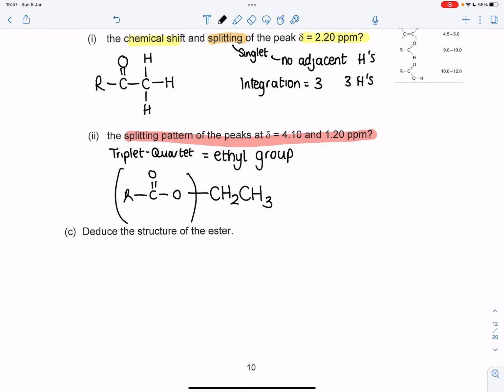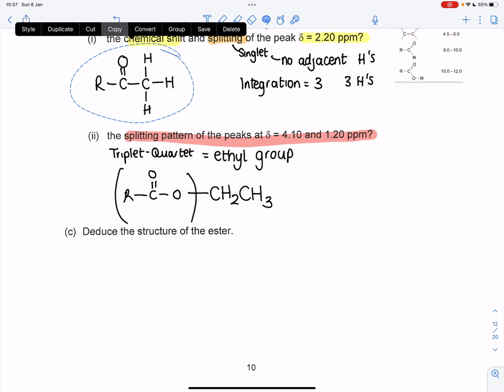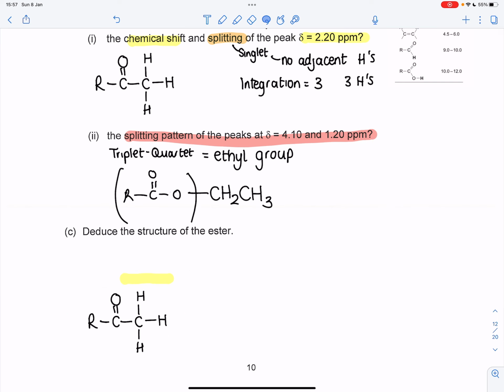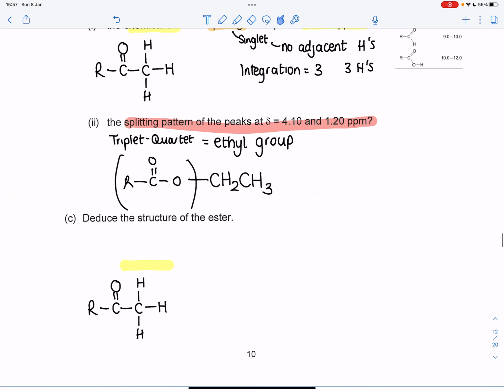These are our 2 jigsaw pieces. We just need to overlap them now, put them together and see that they're the same. So this top peak here that we've got, if I were to pick this up, I can copy this and paste it down here, and if you can imagine now, what we actually need to do is pick it up and flip it over. I'm going to have to do that by scribbling out, but you can imagine it in your head.